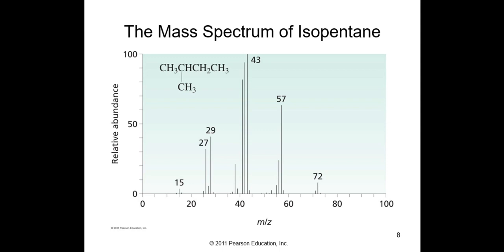Who developed mass spec? The oil industry. Who developed NMR? Big pharmaceuticals, big pharma. They developed mass spec, the oil industry, so they could determine hydrocarbon characteristics from crude oil and now natural gas. So if there's money to be made, they'll put money into developing, and that's what did this. The Petroleum Research Fund, big oil developed mass spec. It's used now, ironically, with environmental problems in litigation.